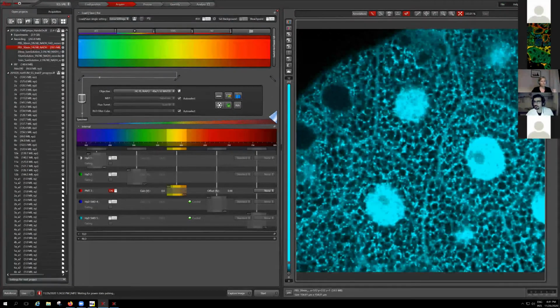So we will see at some point that in our system we might not need to do an IRF measurement every single time that we do a measurement. I think that Mariano had some points about that.